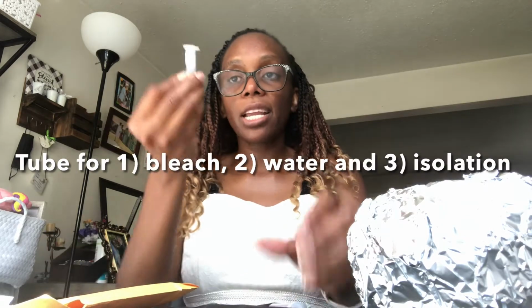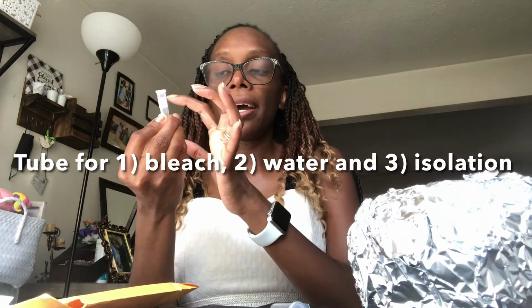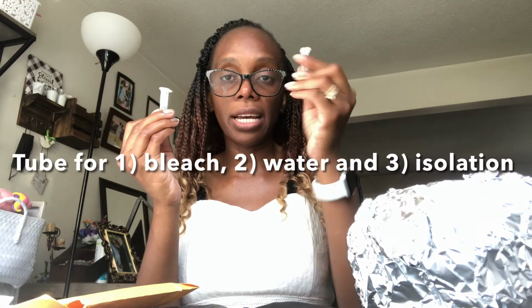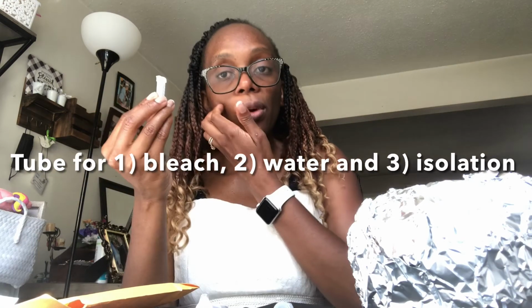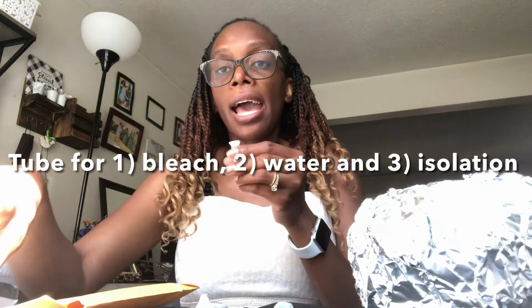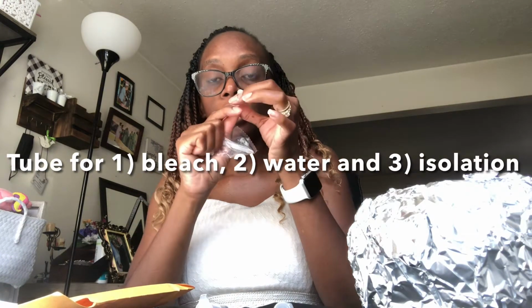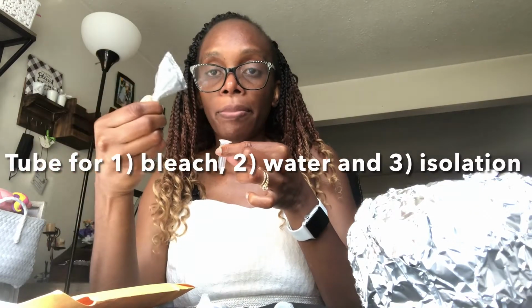And the second one is going to have water, clean water, and that is to then rinse off that bleach solution that has been used to sterilize our root segment. And the third one is where you finally put your sterilized and rinsed off root segment, and we're now going to crush or homogenize our root segment using the plastic pestle.